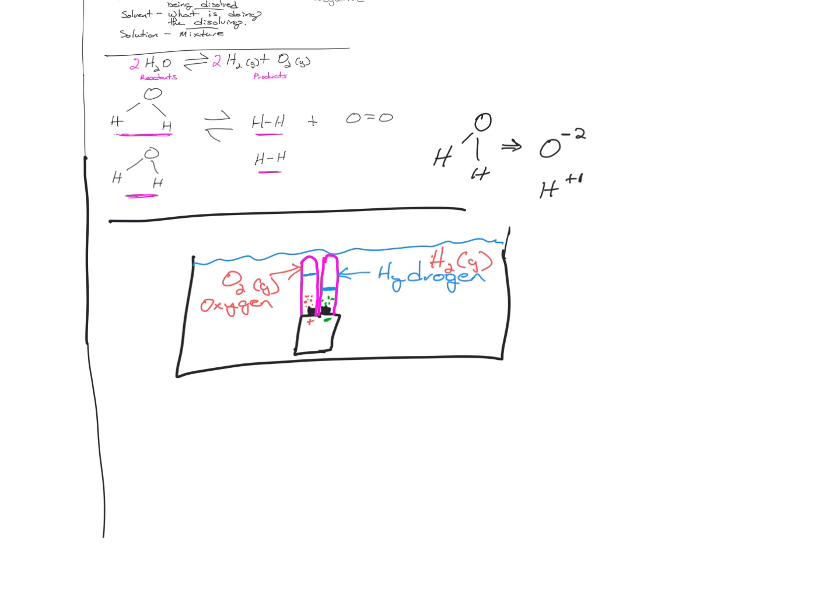So you're going to take your test tube, which is full of air. Yours aren't because it's already underwater. You're going to stick it in there, make sure all the water's gone. Turn it upside down while it's still underwater. Now the water's in there. It's full of water. Do you see that? Yeah. So you put it on top of the nib, the positive nib or the negative nib. You do the same thing with the other one.